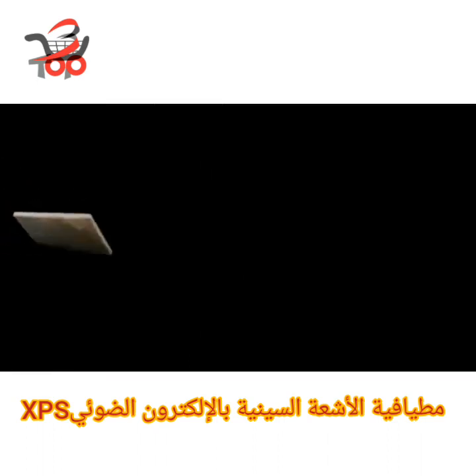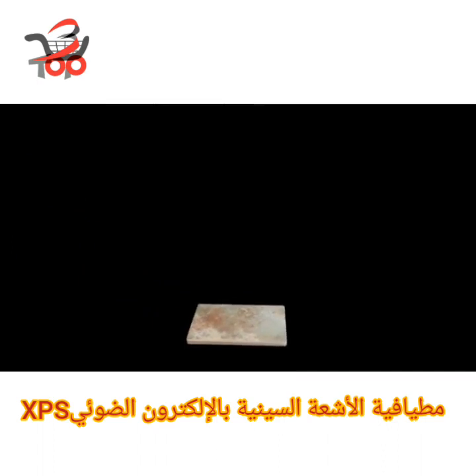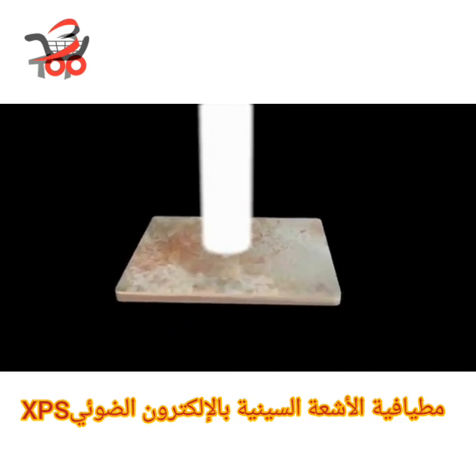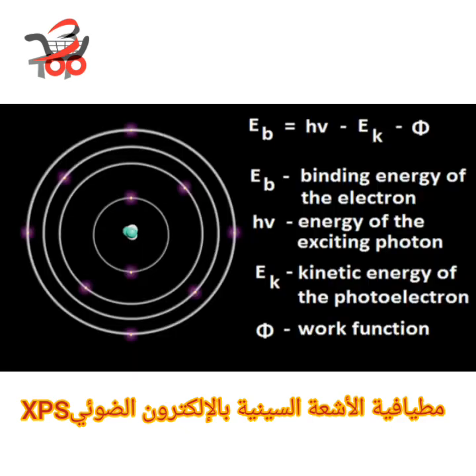The photoelectric effect occurs when a material, such as a corroded steel plate, is exposed to high-energy electromagnetic radiation. This causes the electrons of the sample atoms to be kicked out of the material. These electrons are called photoelectrons and their energy depends on the energy of the exciting primary beam, on the binding energy of the electron, and on the work function.